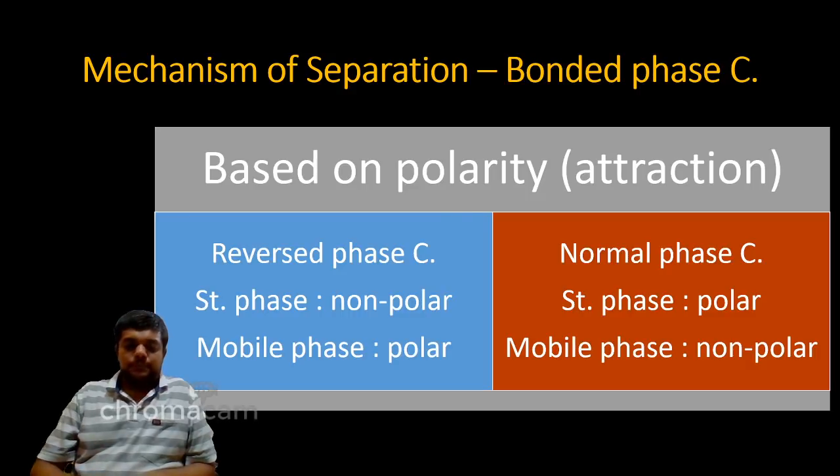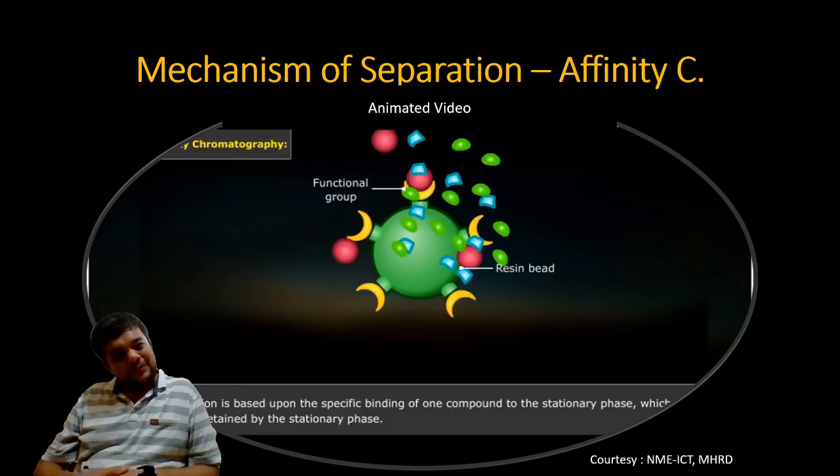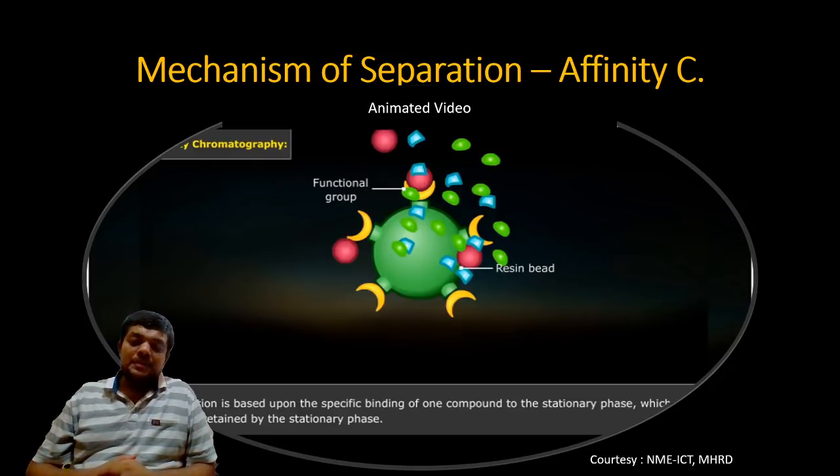Also, mechanism of separation, affinity chromatography. Generally, this is used in the drug industry, in the biotechnology industry. See how. First we'll look to the video and then we will move further.